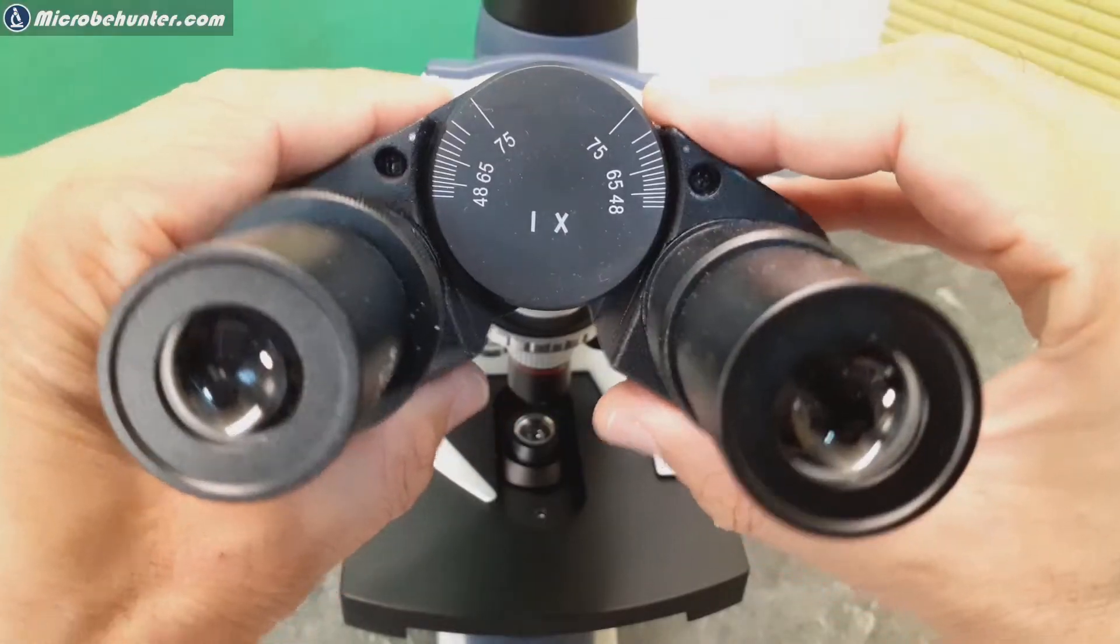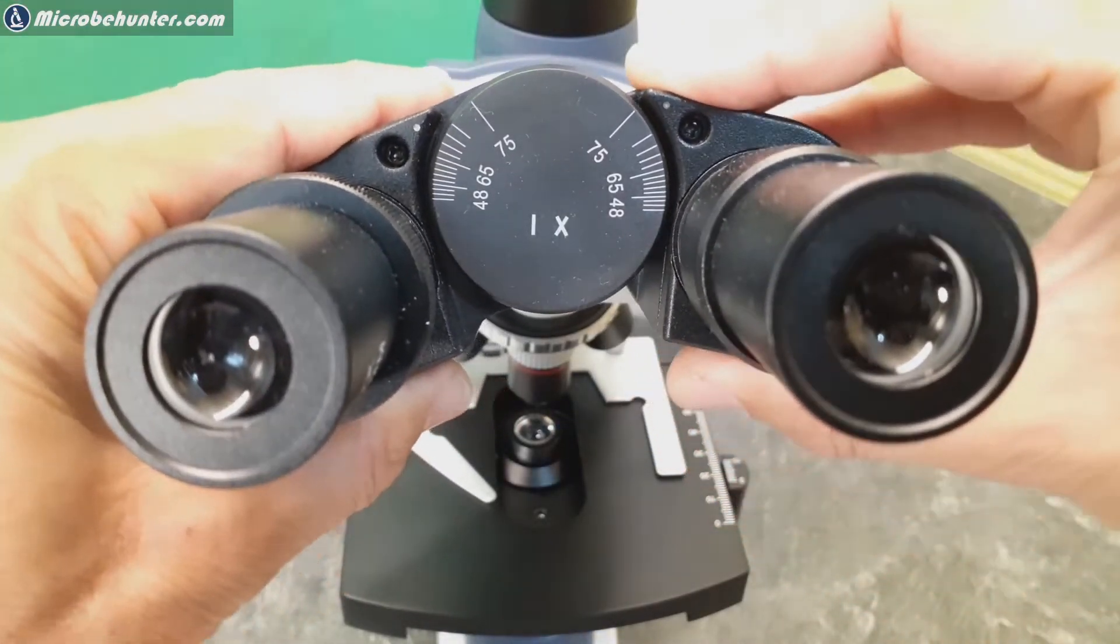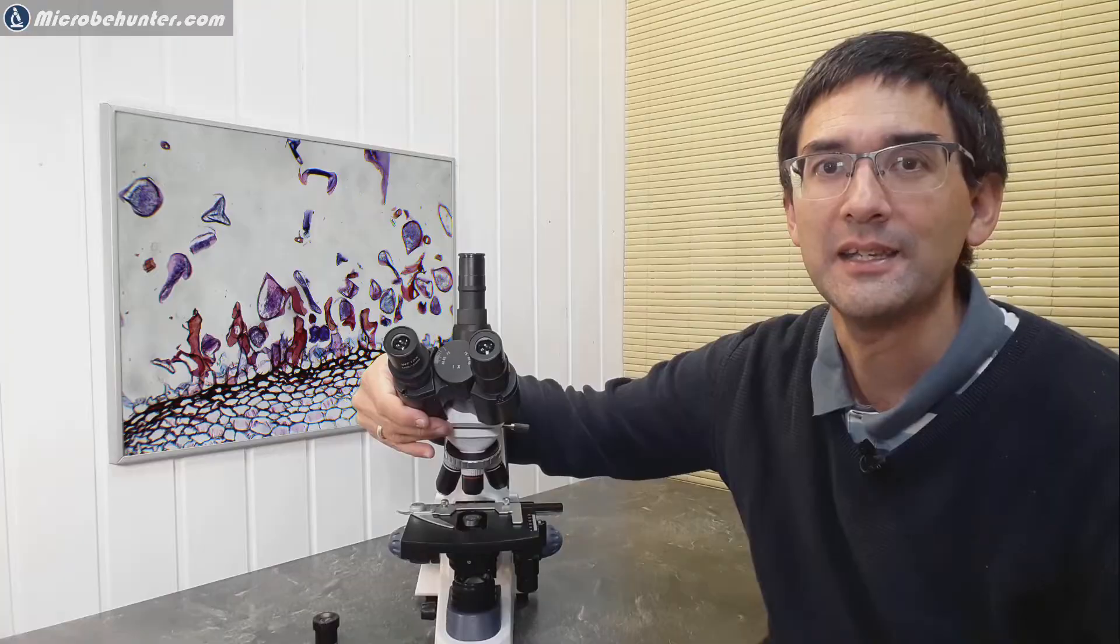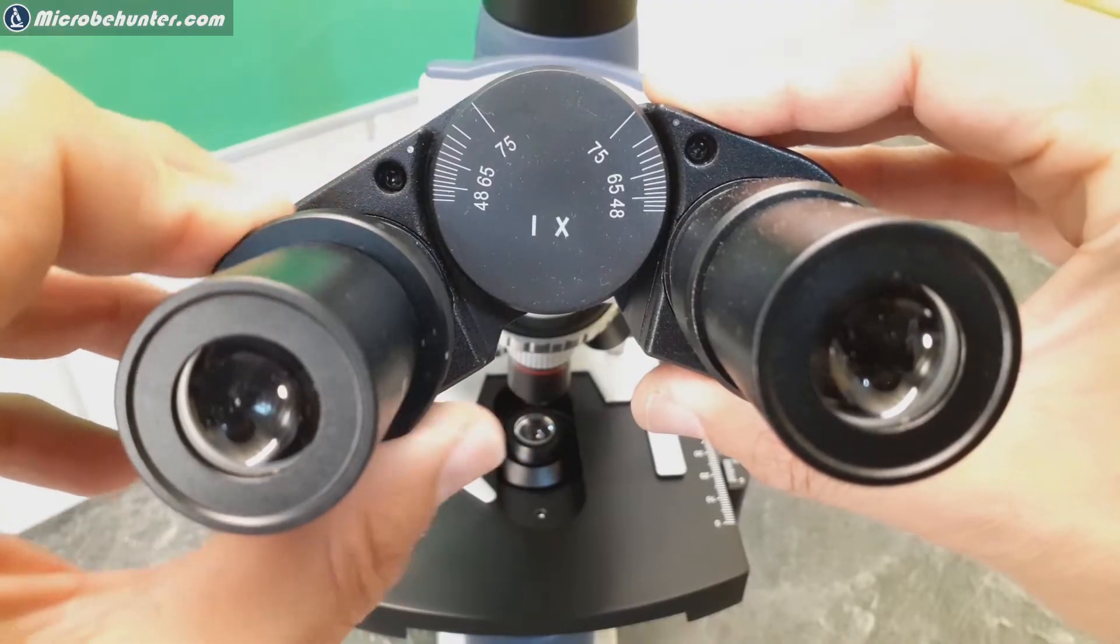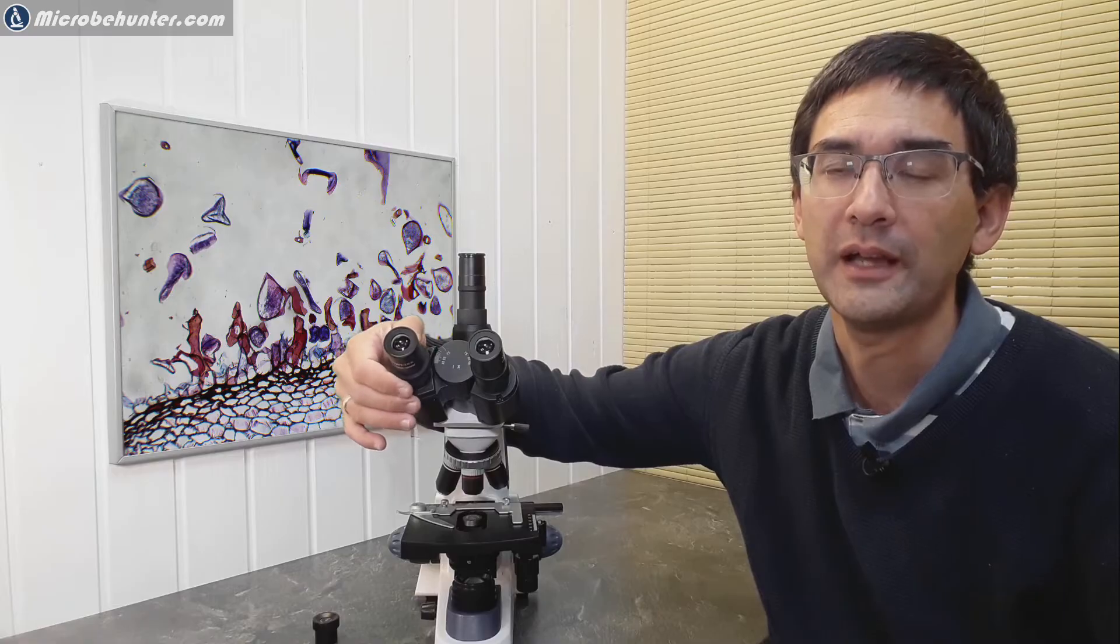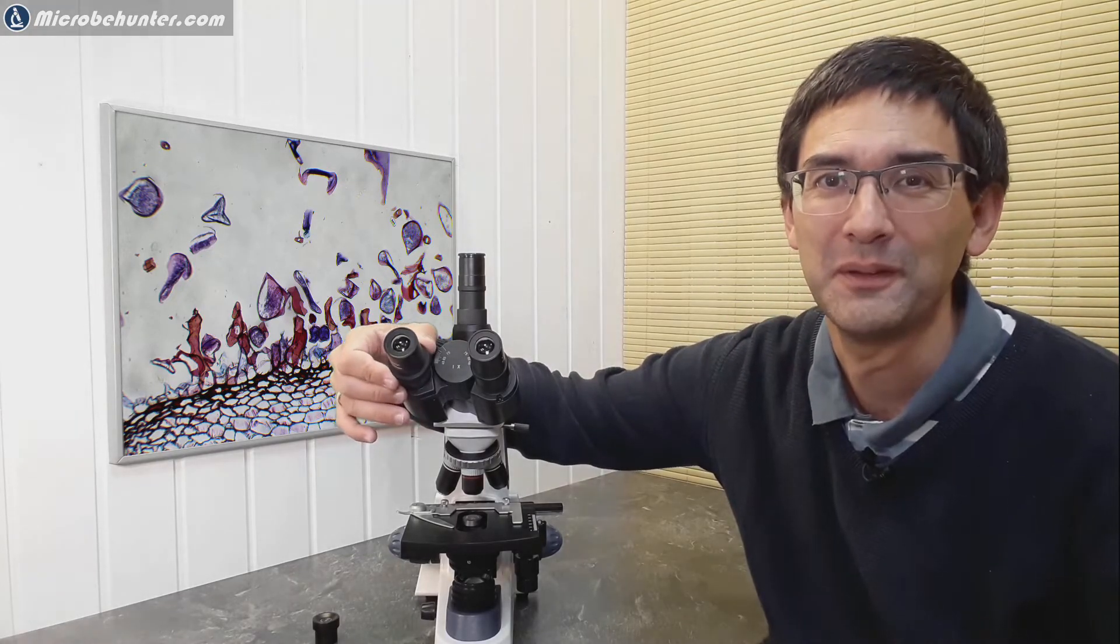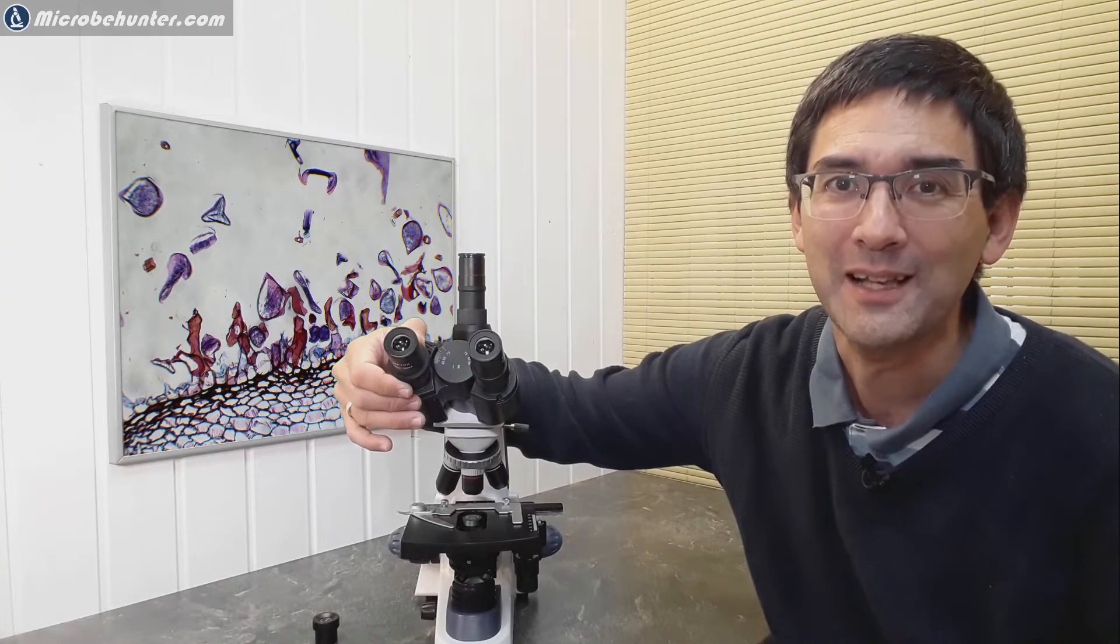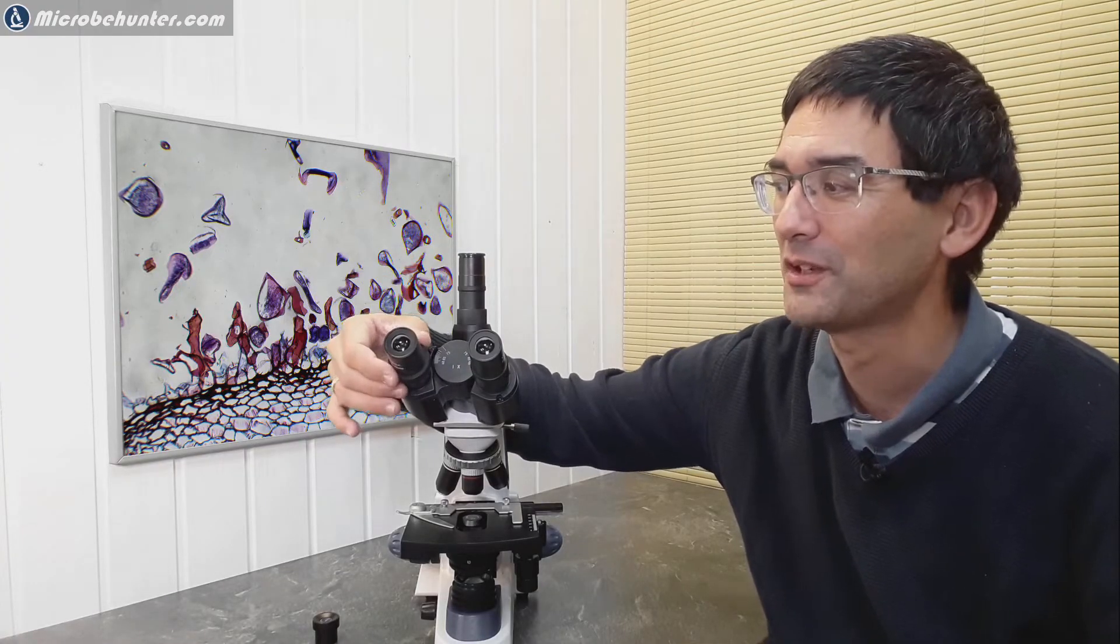It's also possible to adjust for differences in eyesight. There's the so-called diopter adjustment here on the left eyepiece. If you rotate the eyepiece, you can compensate for different vision. If you're wearing glasses like I'm doing, you just keep it set to neutral.